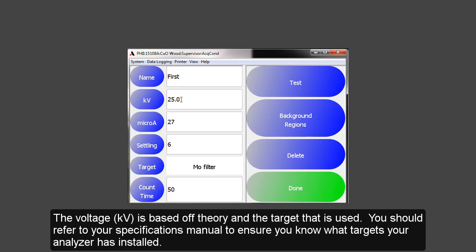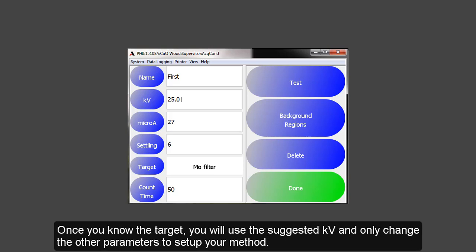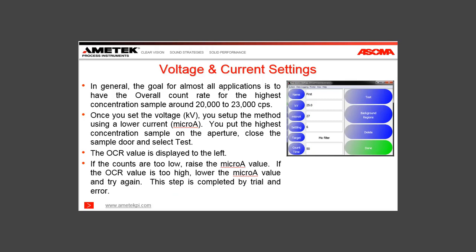You should refer to the Specifications Manual to ensure you know what targets are on your analyzer. Once you know the target, you will use the suggested kV and only change the other parameters to set up your method. In general, the goal for almost all applications is to have an overall count rate for the highest concentration sample around 20,000 to 23,000 counts per second.